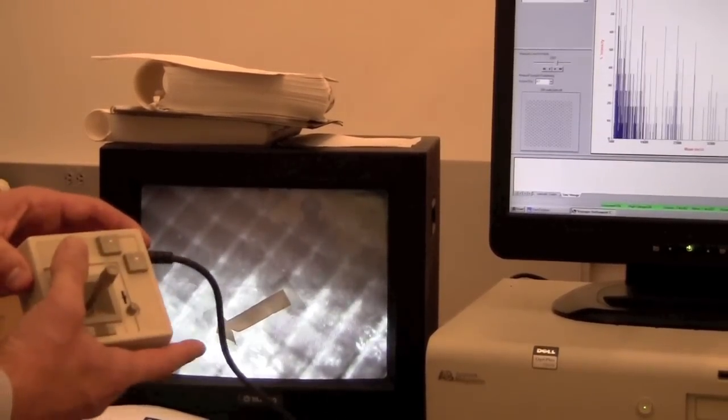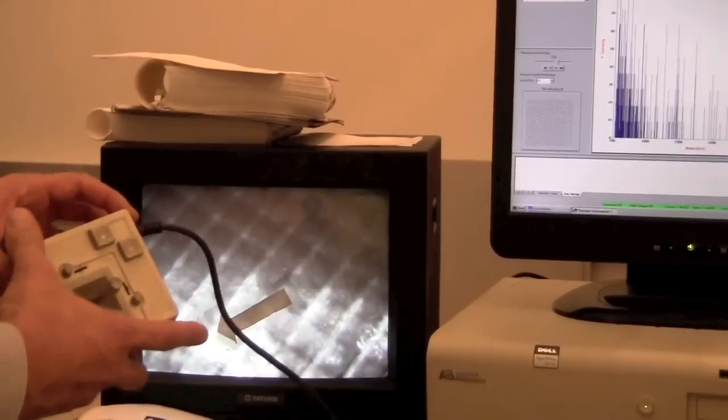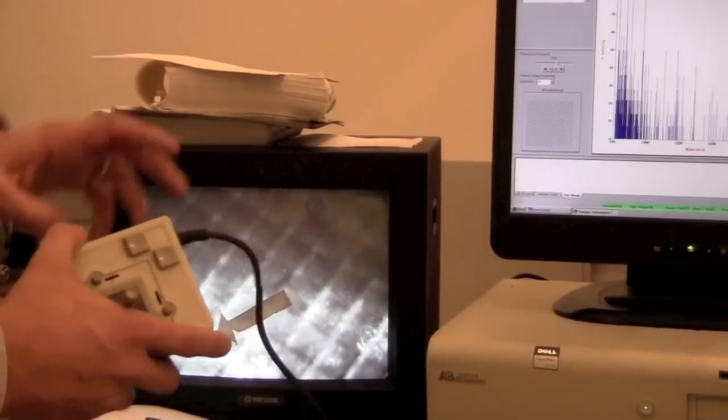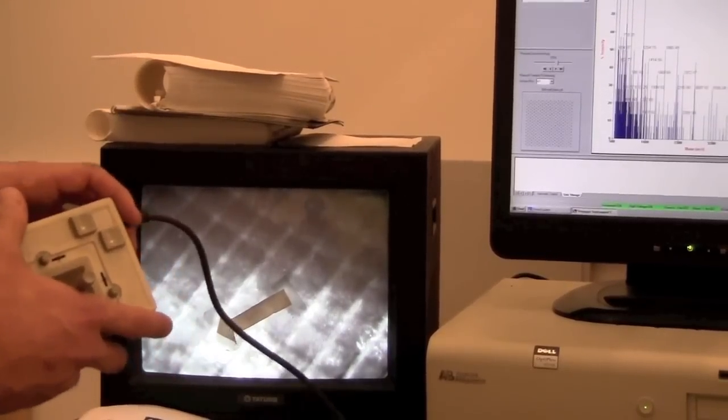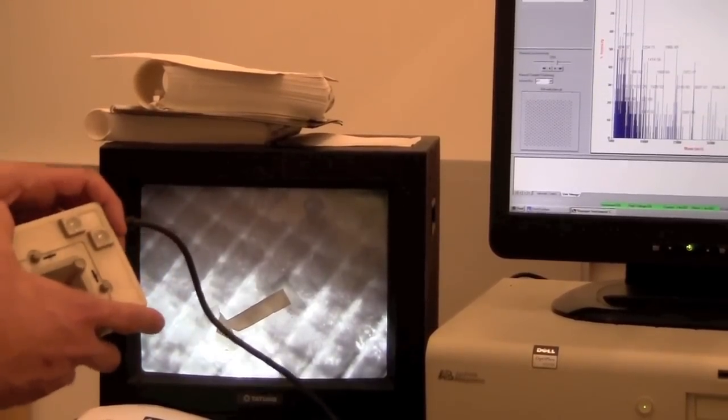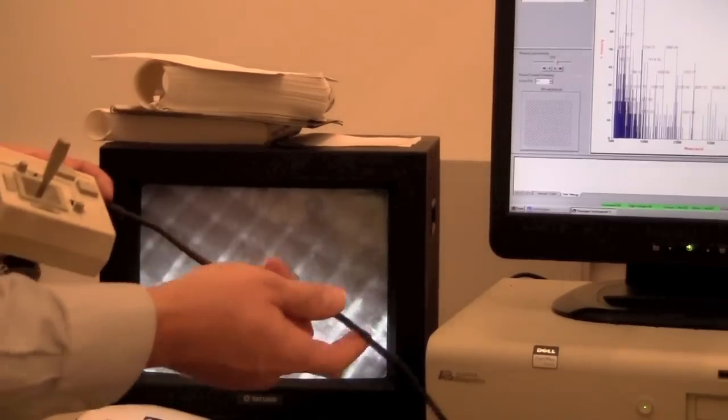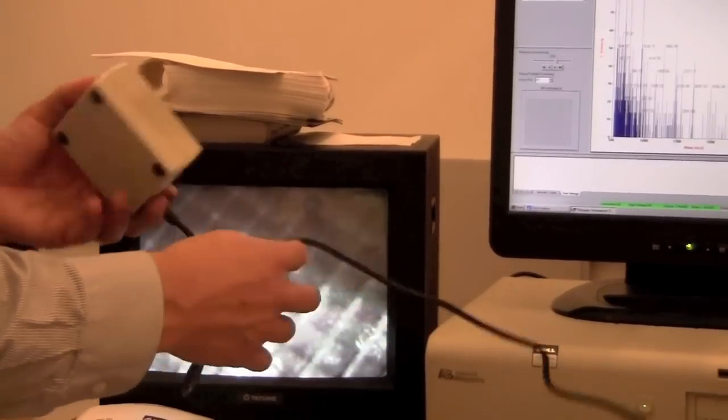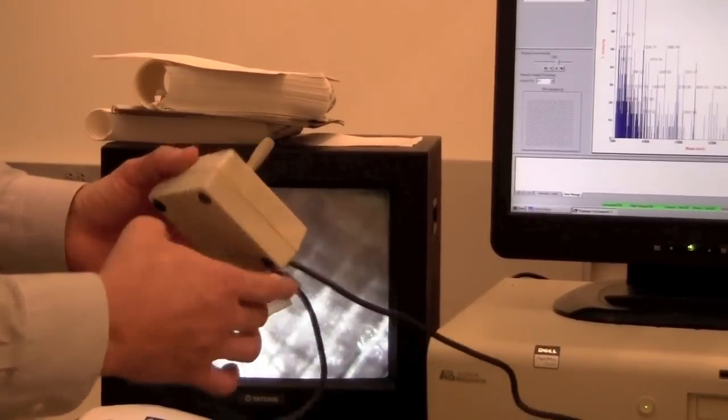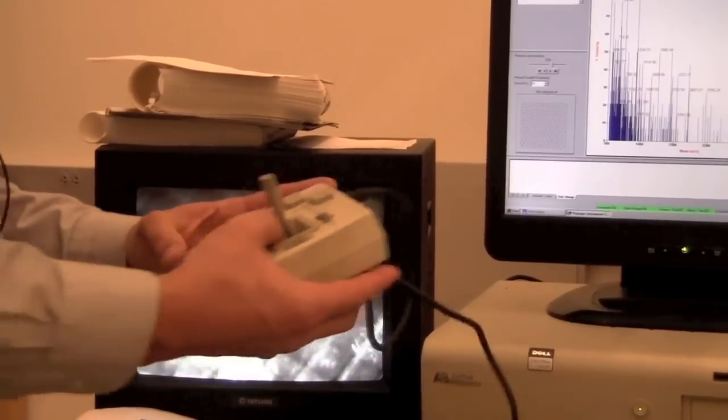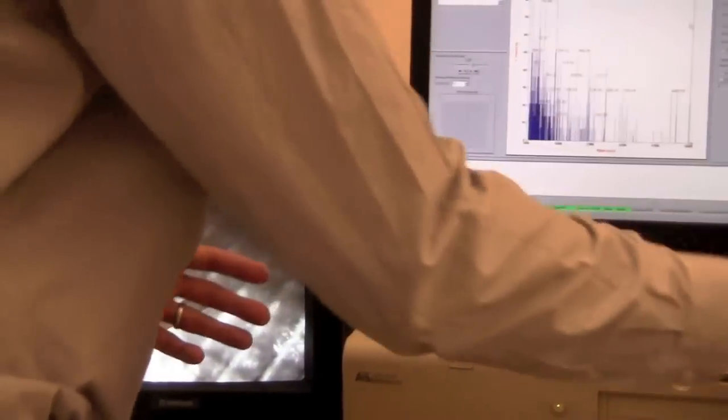You can press fire again and take data over the top of what you did before. If you want to save the particular data set, then you'll want to change the file name before you collect another data set. In this case, let's assume that we're done.